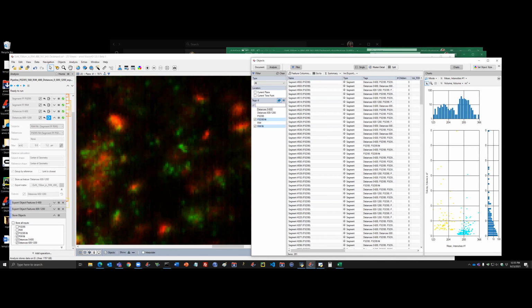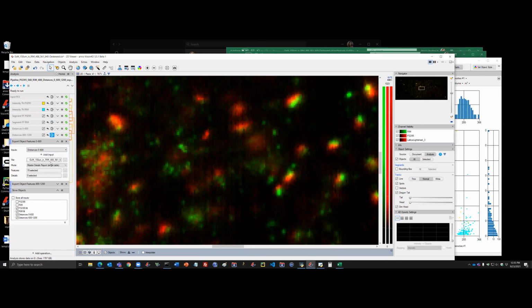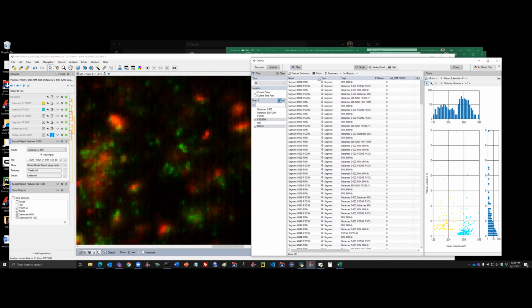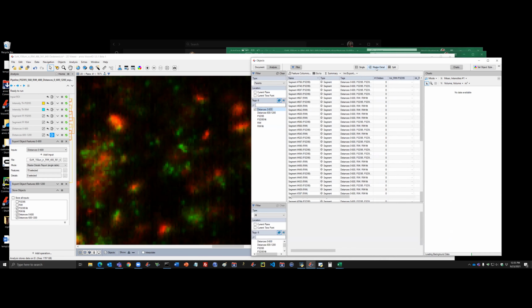And yes, for the export here, we can use this very similar master detail report that exists as one of the options, and populate the selection with the same features that will also be exported, that we can visualize and compute live for the particles. So in this example, we go to the master detail report.